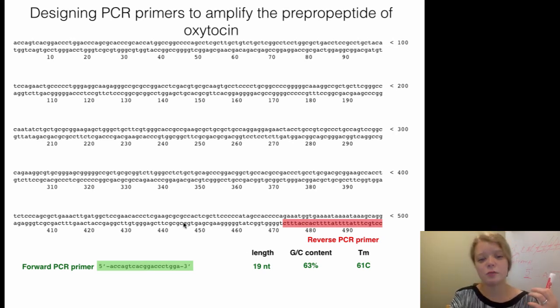Okay, so now I have this primer. What about my reverse primer? That was far worse. It had a very low melting temperature and very low GC content, simply because the ends of proteins, the ends of genes tend to have a lot of T's and A's in there because it's already kind of thinking about making a poly-A tail. It's a behavior I've found a lot of times in a lot of C-terminal regions. 3' regions of a gene.